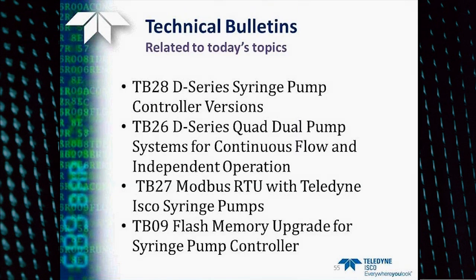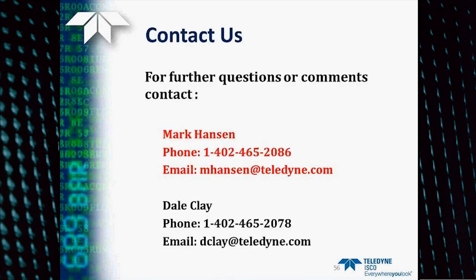And the 4 technical bulletins that we did talk about today are TB28, the syringe pump controller versions, TB26, the 4-pump operation, TB27, the Modbus RTU, and TB09, flash memory upgrading for your controller. For further information, you can contact either myself or Dale Clay at the email addresses or phone numbers listed here.